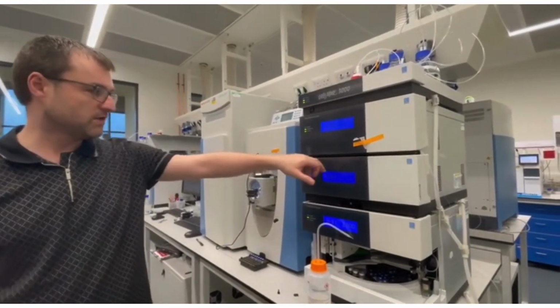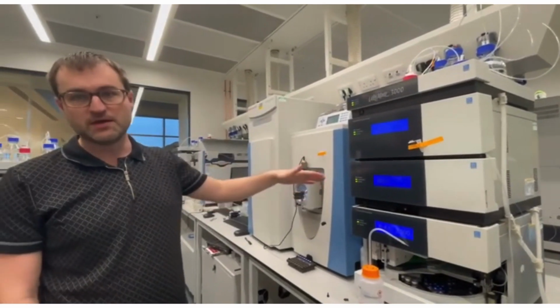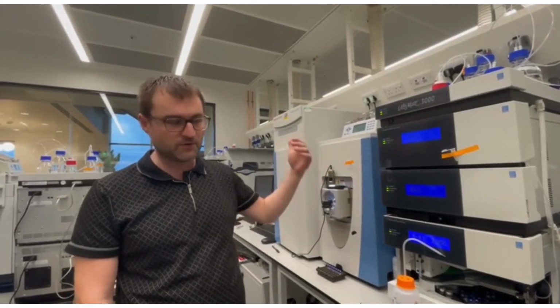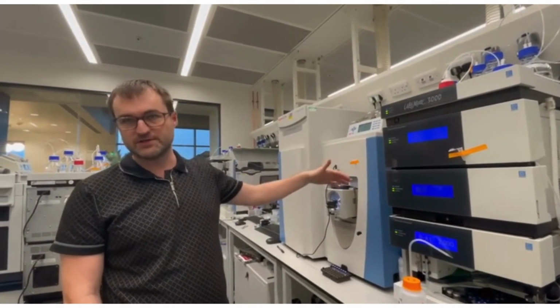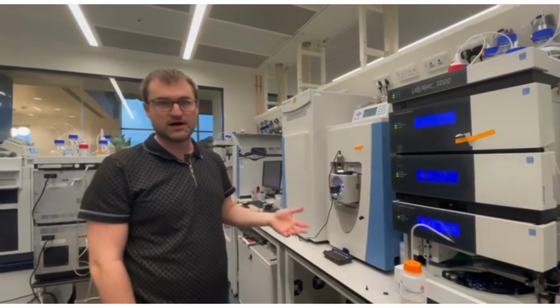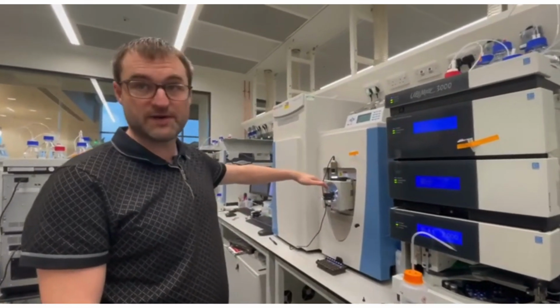Then from the column, as we separate the peptides, they elute in groups. The better you separate, the smaller these groups. In a perfect world, you would want one peptide to elute at a time. In reality, there are millions of peptides, so they elute hundreds and thousands at a time. As they elute, they go into the mass spec, right?